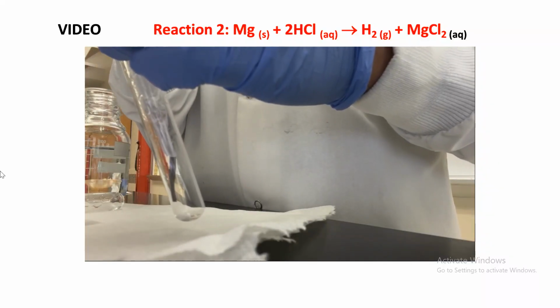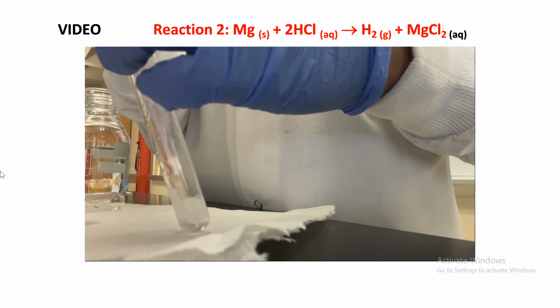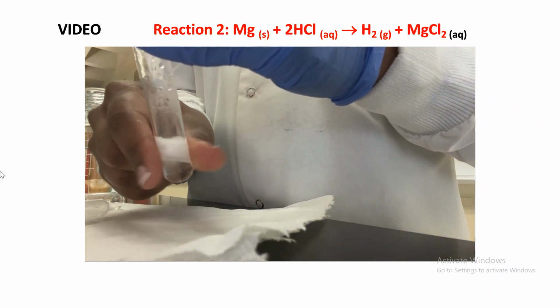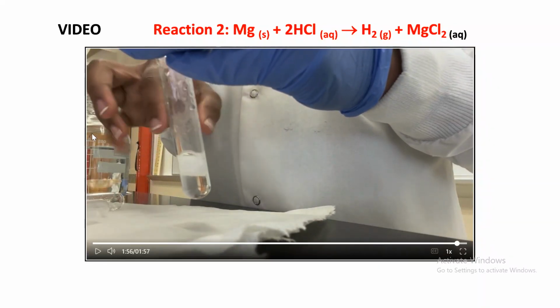We can do it one more time with a bigger piece, and notice that the acid is like eating it. It's eating the metal. Now, is it getting hot or is it getting cold? It's getting extremely, extremely hot.